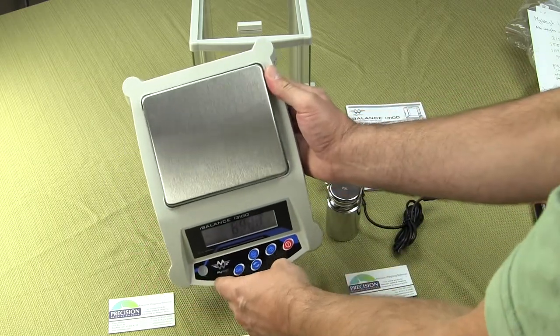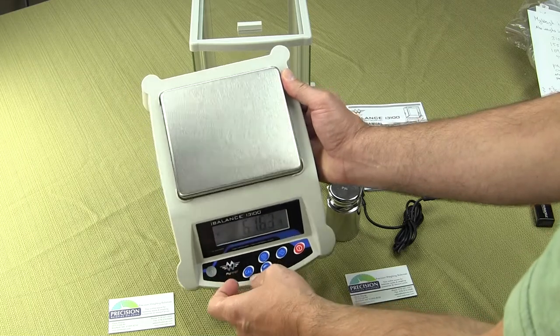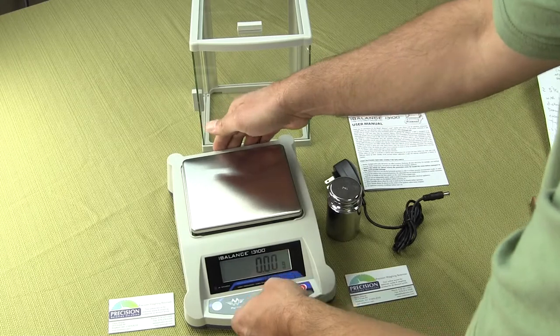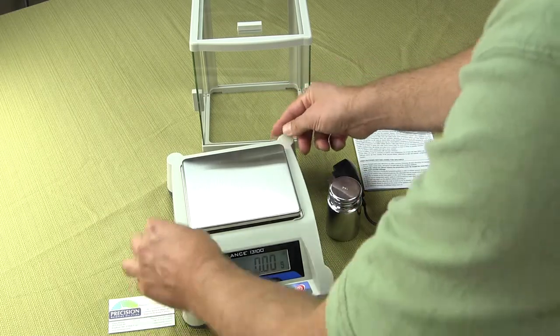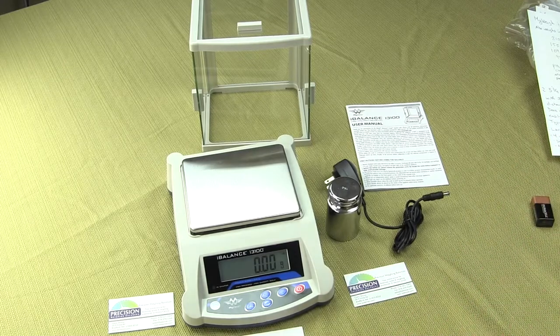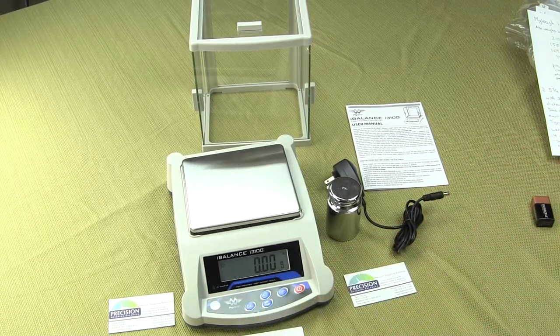On the front of the balance we have a spirit bubble indicator. The spirit bubble is used to level the balance itself. When you want to calibrate or use the balance, you always want to make sure that the balance is level and the feet are all touching the surface, with the bubble right in the center.